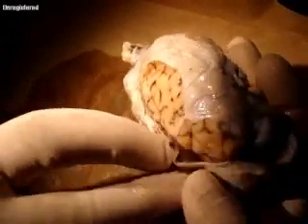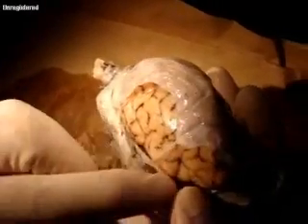Okay, and you'll notice when you look at the tough mother at the top of it that it actually goes down. If you look at the side, you'll see it kind of goes down in between the two hemispheres of the brain.